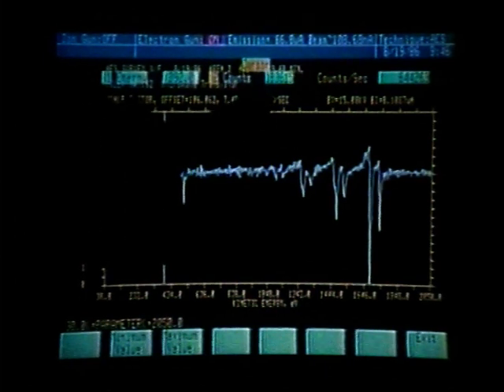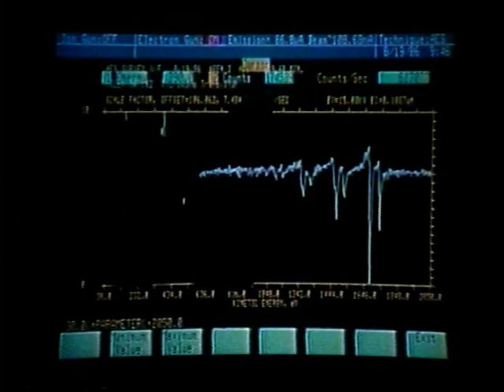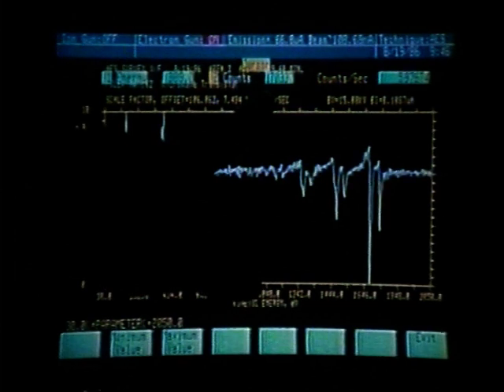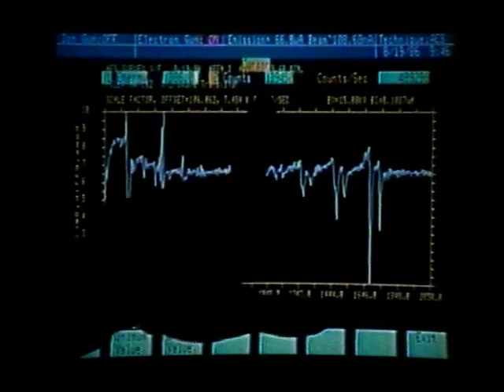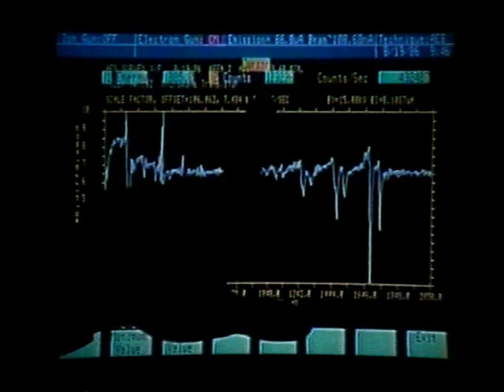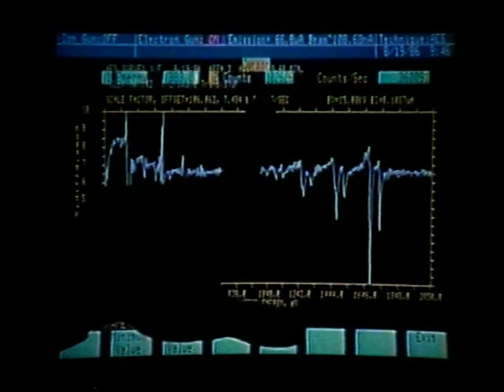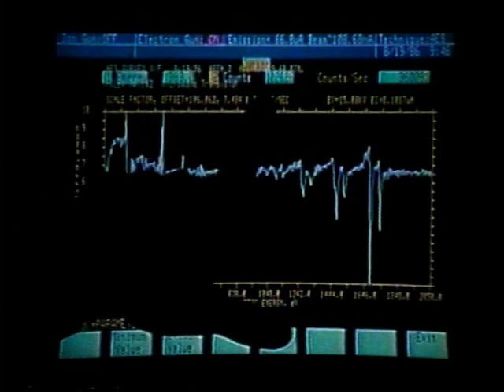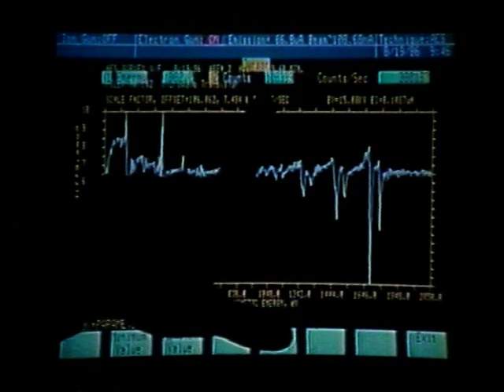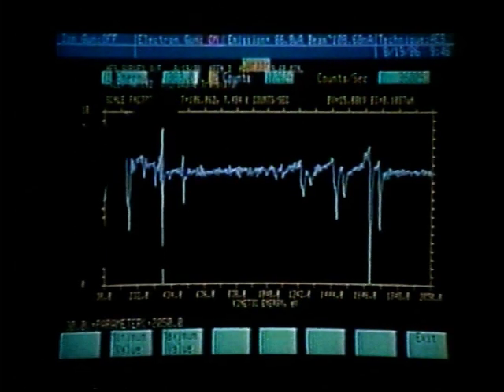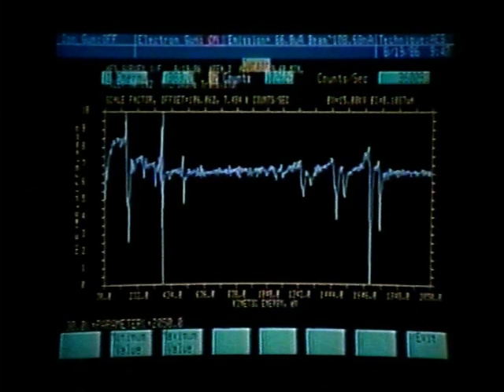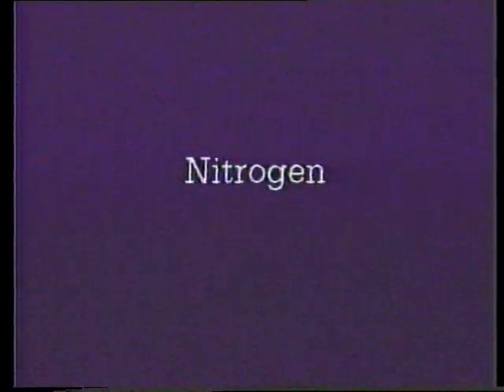Slewing the cursor and watching counts: 183, 178, 174, 170, 164, 154, 139, 123, 109, 102, and 108 — so 102,000 is the negative excursion of this peak at an energy of 383. Using the handbook, we can identify that as a nitrogen peak.